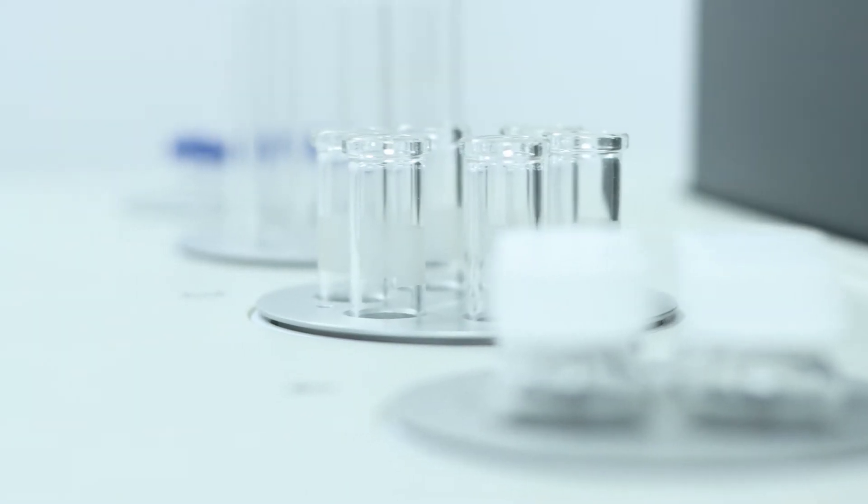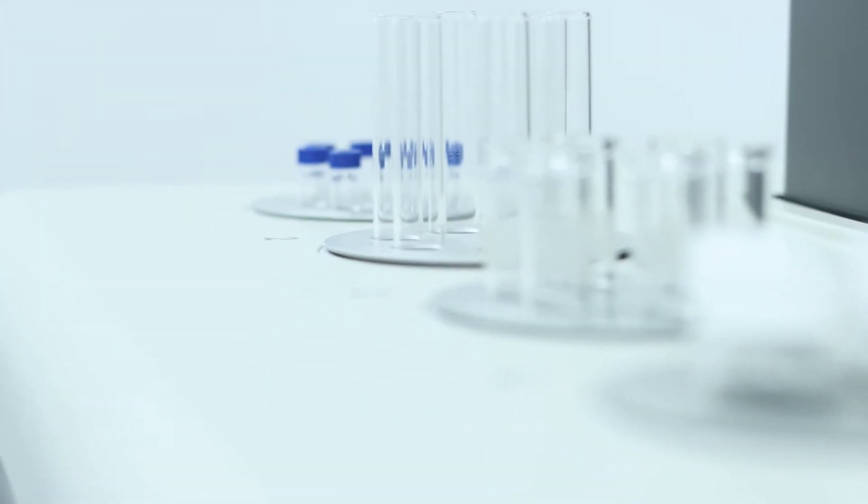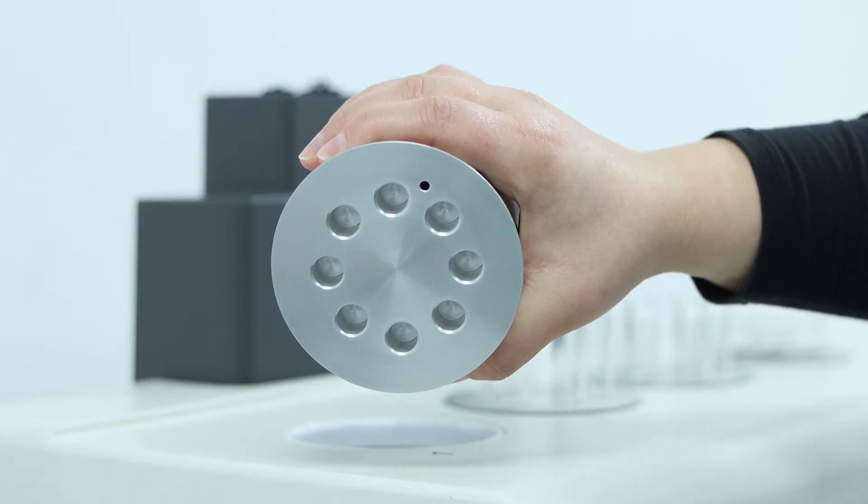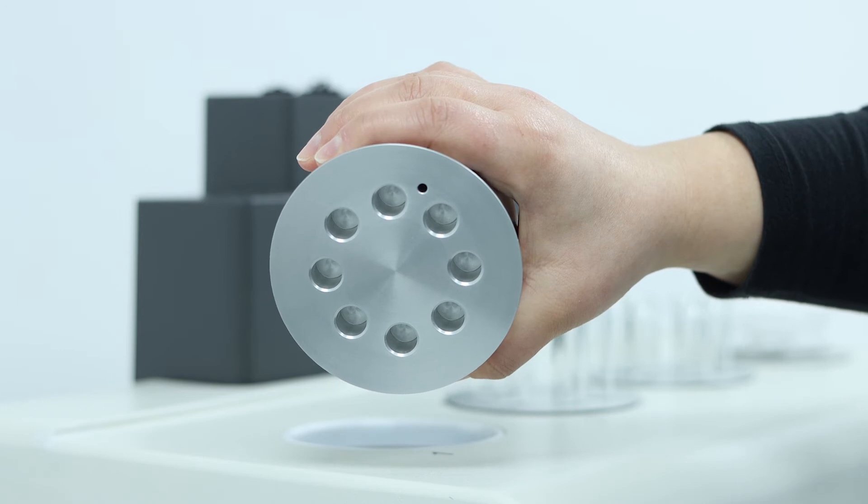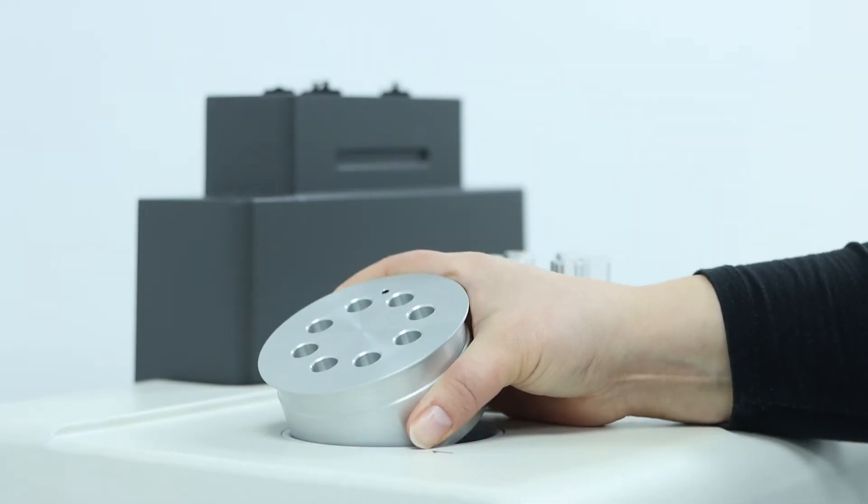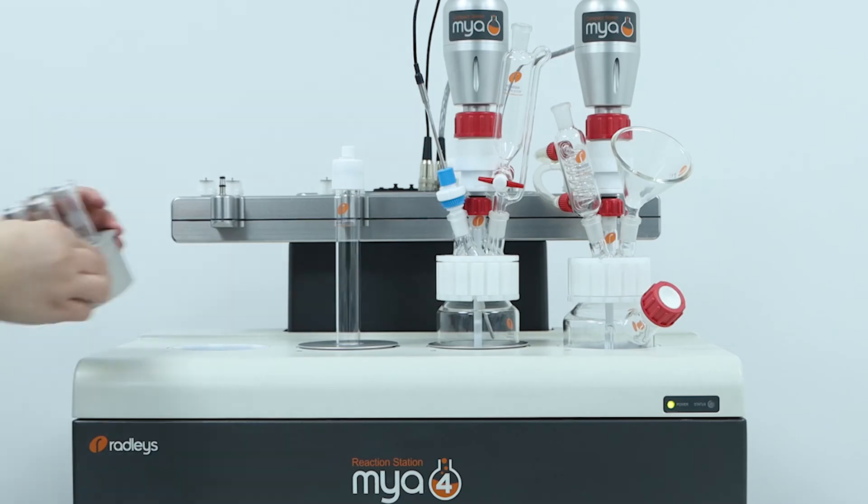so you could use tubes and vials with no head at all. You can use your own tubes and vials as long as you have the right aluminium insert. And if we don't already have an insert for your usual tubes and vials, we can do custom ones.